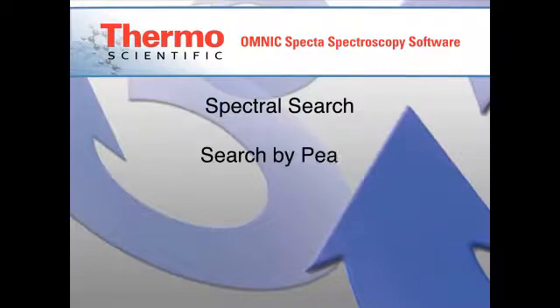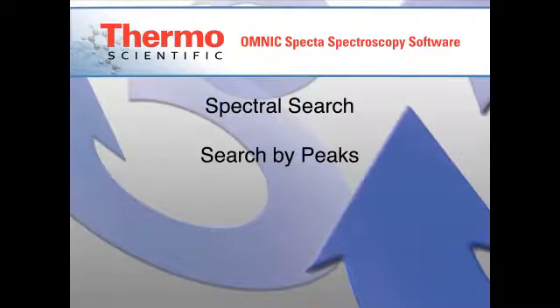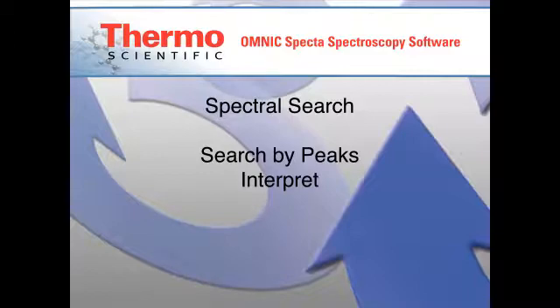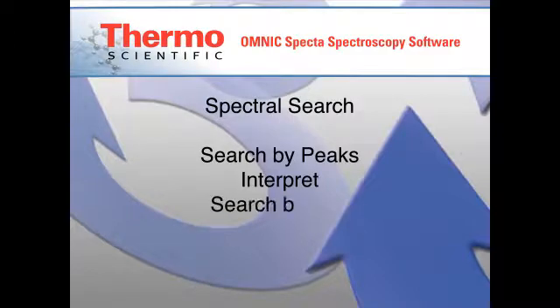Our traditional search operations provide state-of-the-art tools for identifying materials by comparing the unknown spectrum with commercial libraries or any spectra you've tagged as search references.